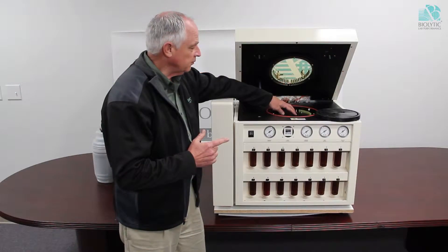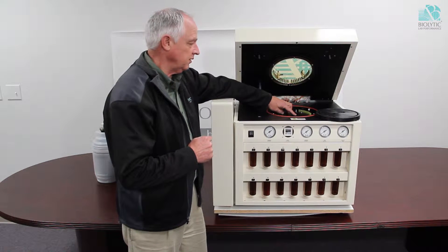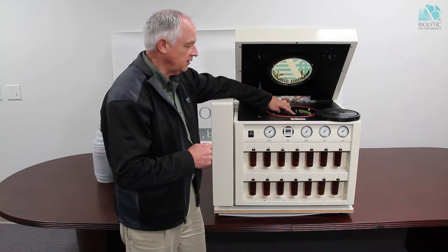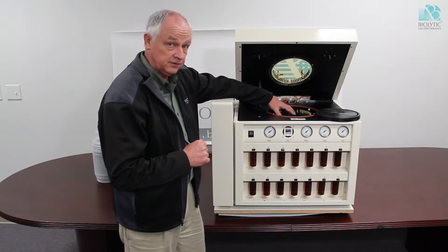The new upgrade provides four drains so that you can dispense into all four banks and then drain all four simultaneously. This saves a lot of time during synthesis.